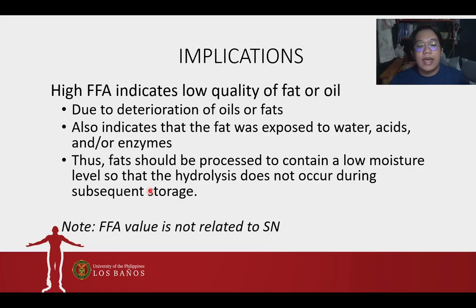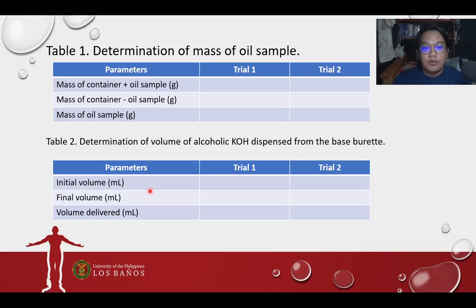And note that FFA value is not related to saponification number. Bakit? Because FFA value corresponds to the quality of the oil, while your saponification number corresponds to the identity of your oil. Okay?